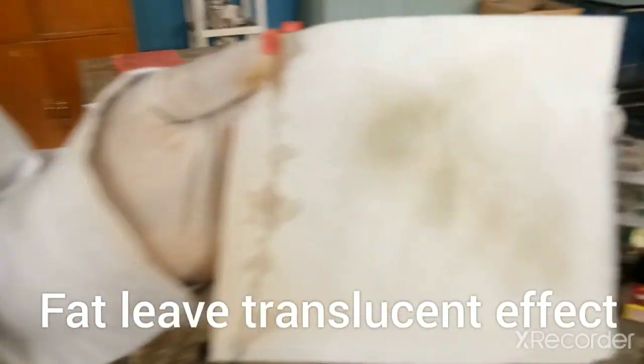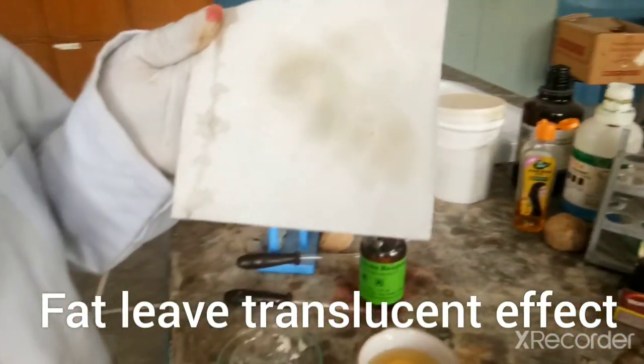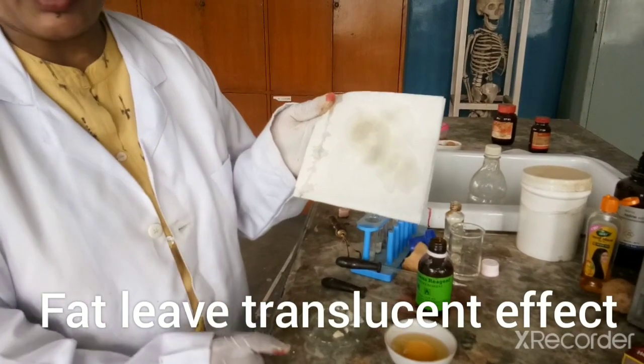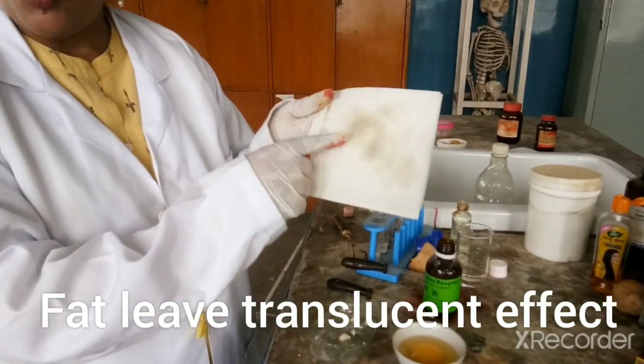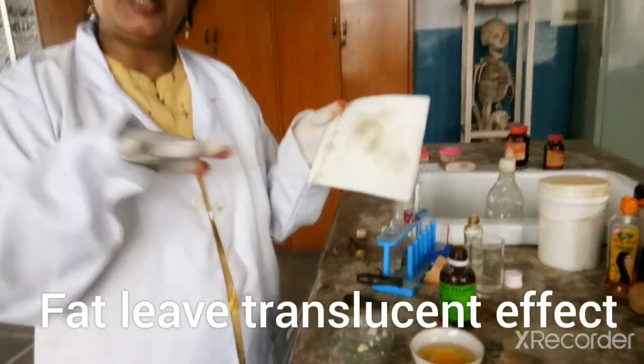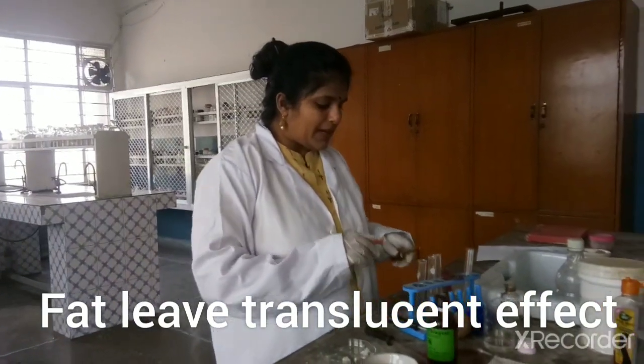You can notice the translucent nature of this paper. This translucency is because of the oil, because of the fat in that chapati — from the butter which we have put on it.